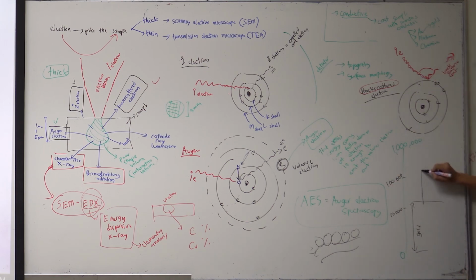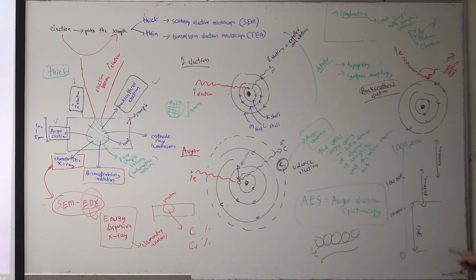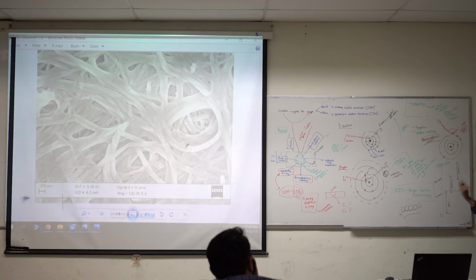And then you have platinum, which normally can go from here until here. For chromium you can go here. The reason is simple: the chromium particle is smaller. That's why you get a nice image. The gold particle is big, but gold is cheap. Of course, gold is expensive in general, but actually chromium is more expensive here, in this case. Gold is cheap but has big particles. Chromium is expensive, but its smaller particles allow you high resolution.